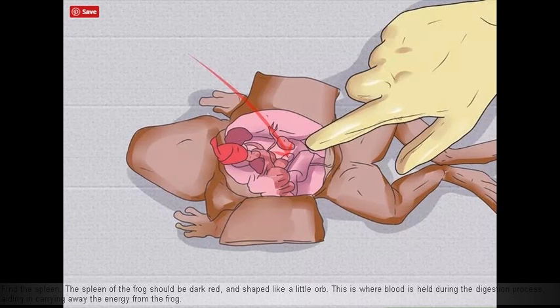Find the spleen. The spleen of the frog should be dark red, and shaped like a little orb. This is where blood is held during the digestion process, aiding in carrying away the energy from the frog.